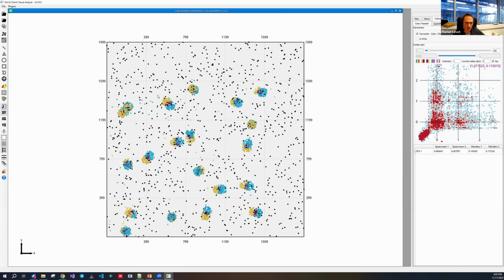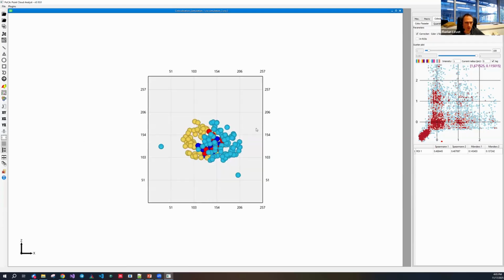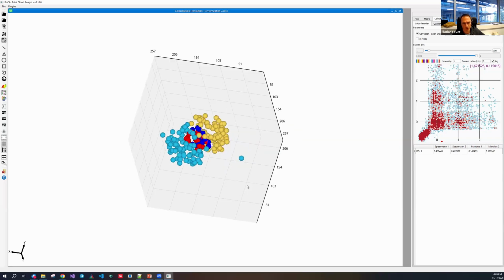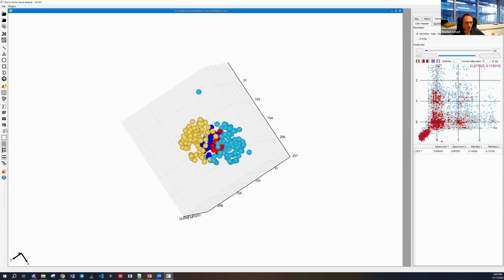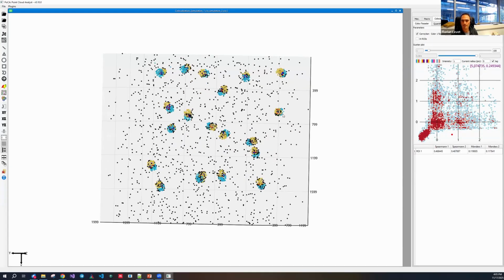And here you can very easily go to your data in order to see exactly where the colocalization is happening, and if it makes sense. So really, you can then apply as you wish and see how it will change your result or not. Okay.